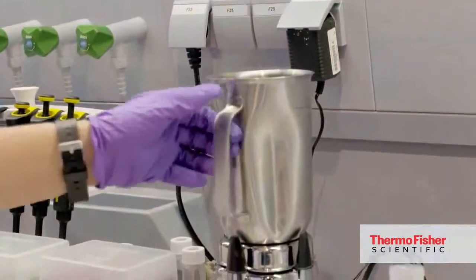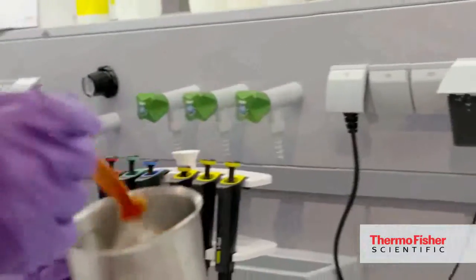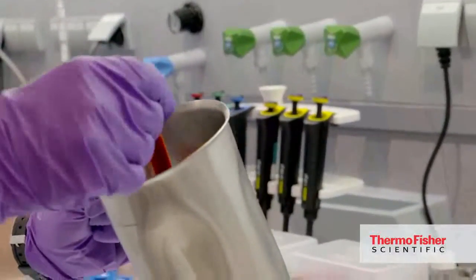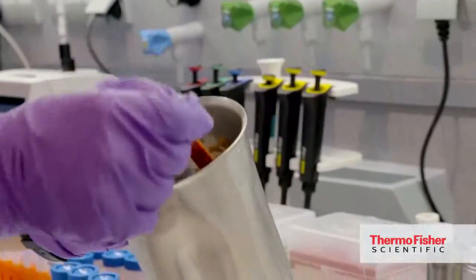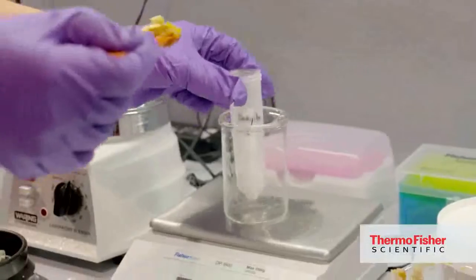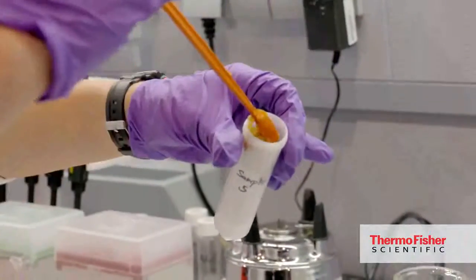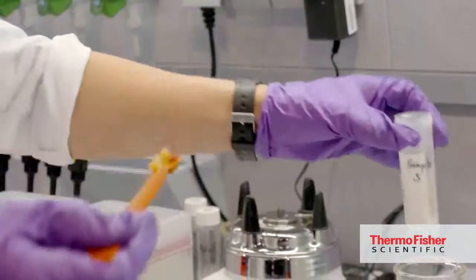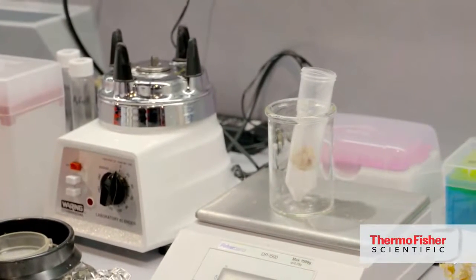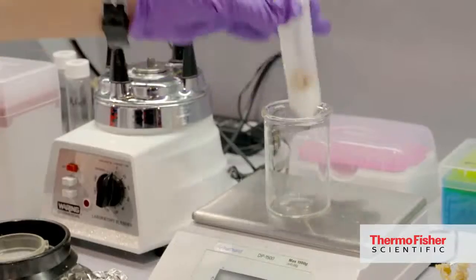So we have the homogenate. We take the homogenate for the classical catchers method, very similar to what we did for the ASE extraction. So we weigh 10 grams of sample directly into the extraction tube, which is a pre-prepared tube. It already contains some salts and can also contain buffers.